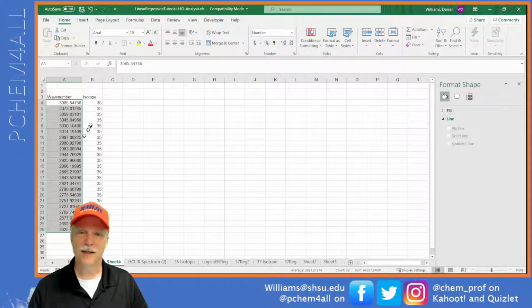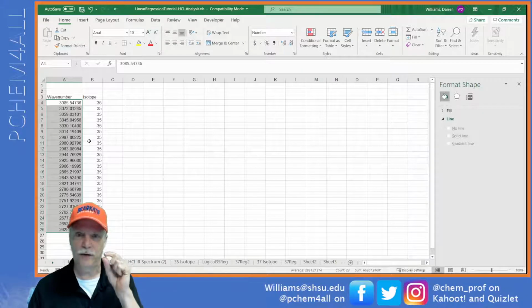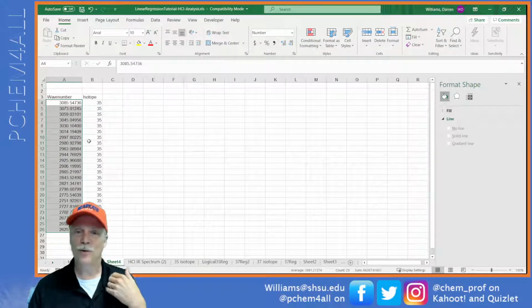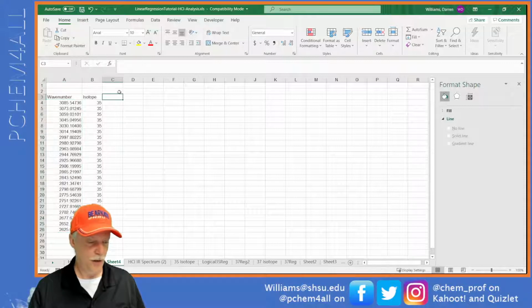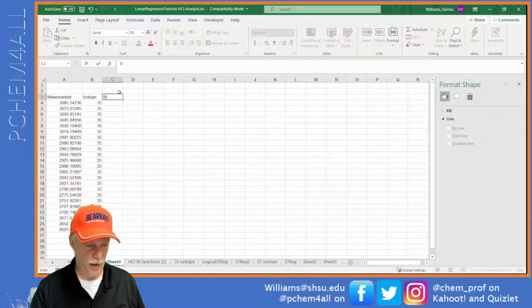Let's now assign the spectrum. So there's peak picking. We've picked the peaks. We've given the frequencies of every peak. That's peak picking. Now we need to assign them. Assigning them means we're putting quantum numbers on all of these transitions. So we need to assign the R values and the P values, and the J, J equals 0 to 1 or 1 to 2 or 2 to 3. That's what we're calling a spectral assignment. And so over here we're going to call it branch number, or branch.